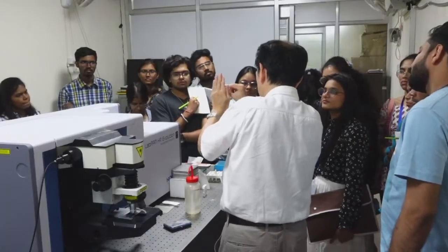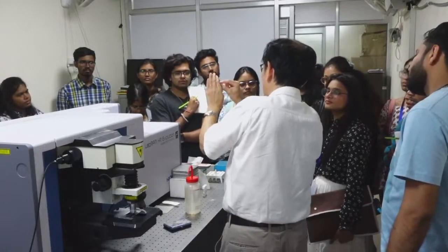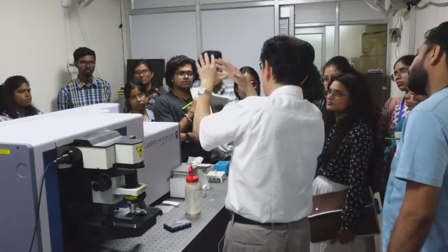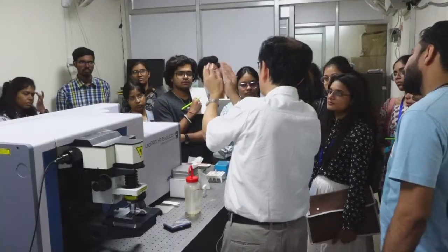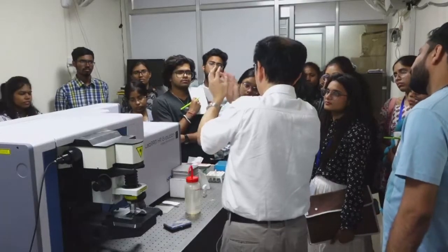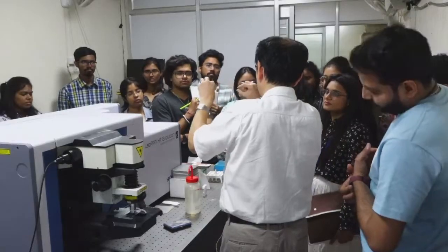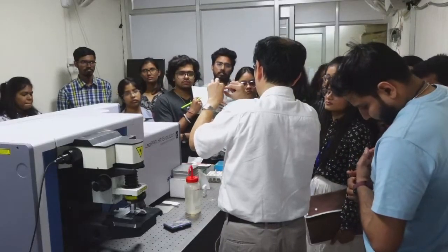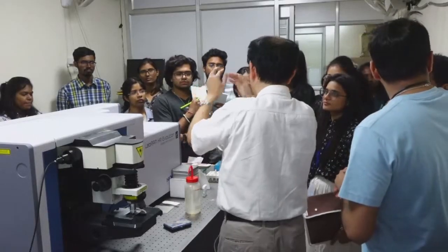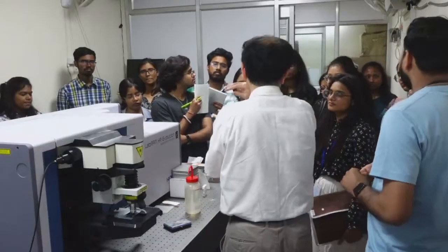So if the sample is extremely thin, only a limited part of the focal volume is used. If the sample is thick enough, the focal volume is all covered by the sample. In that sense, an extremely thin sample does not give a strong signal, and so some thickness is preferable.